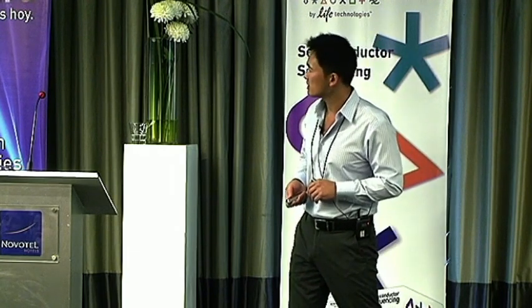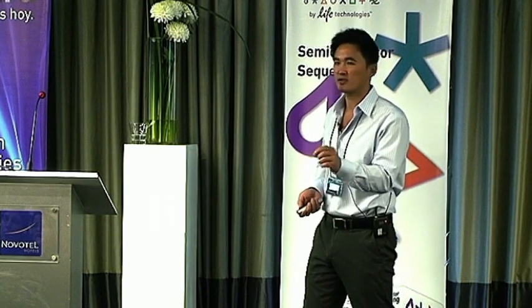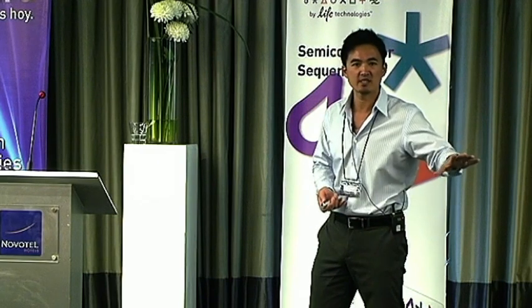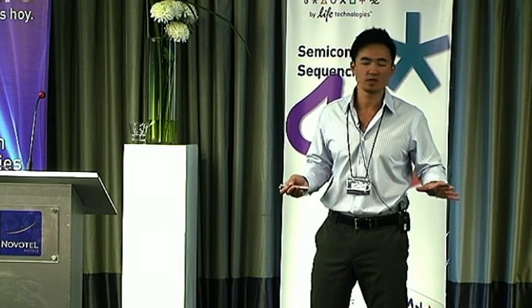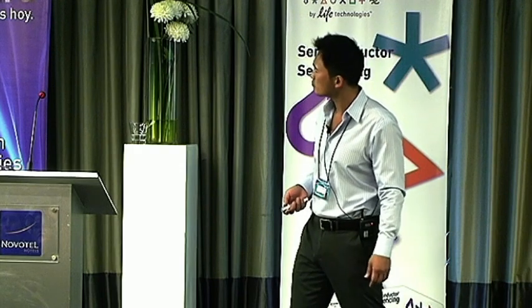That's where digital PCR can actually come in, studying copy number variation at a much higher level. You can actually get down to about 10% differentiation. So if someone had 10 copies and the other person had 9 copies of a gene, you'd never be able to do that with qPCR. But with digital PCR, it's been demonstrated.